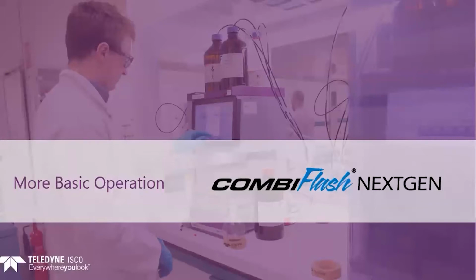We just covered the minimum needs to start a run very quickly using a default method that the system loads when it reads a column. In the next section, we will describe how to use thin layer chromatography, TLC, and the gradient optimizer to improve peak resolution.